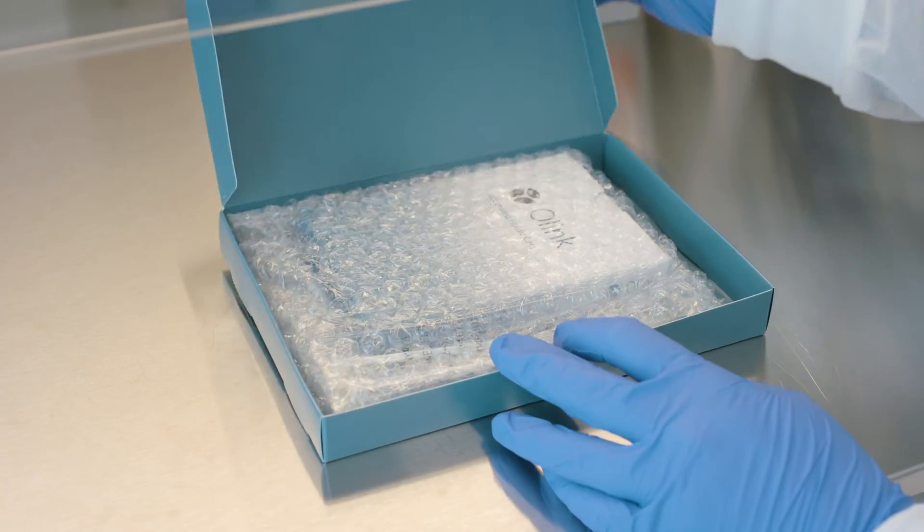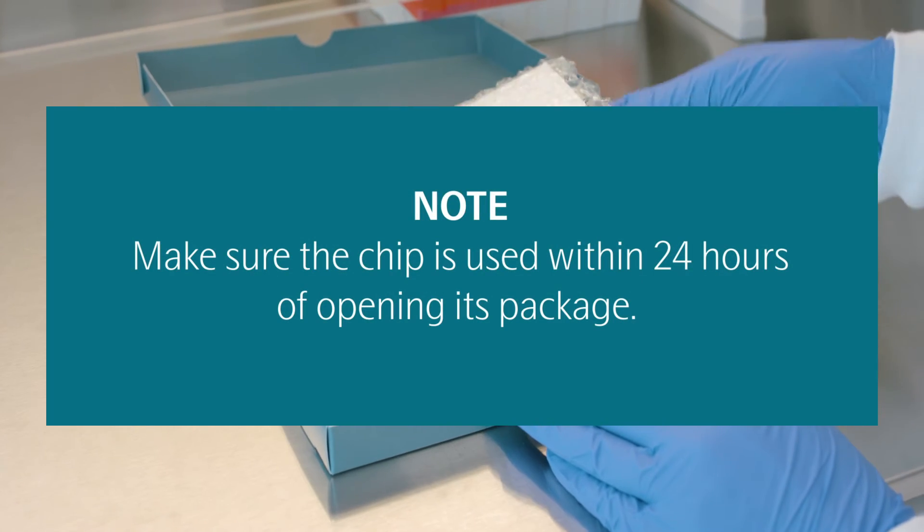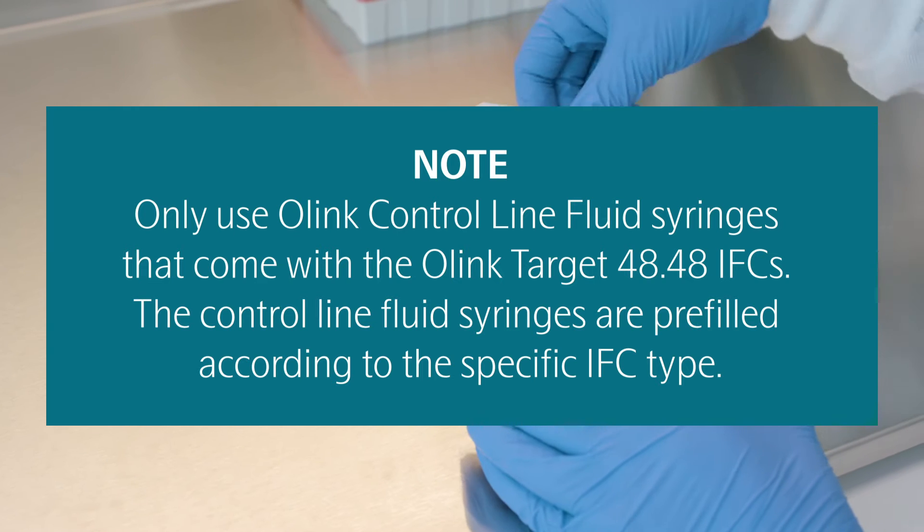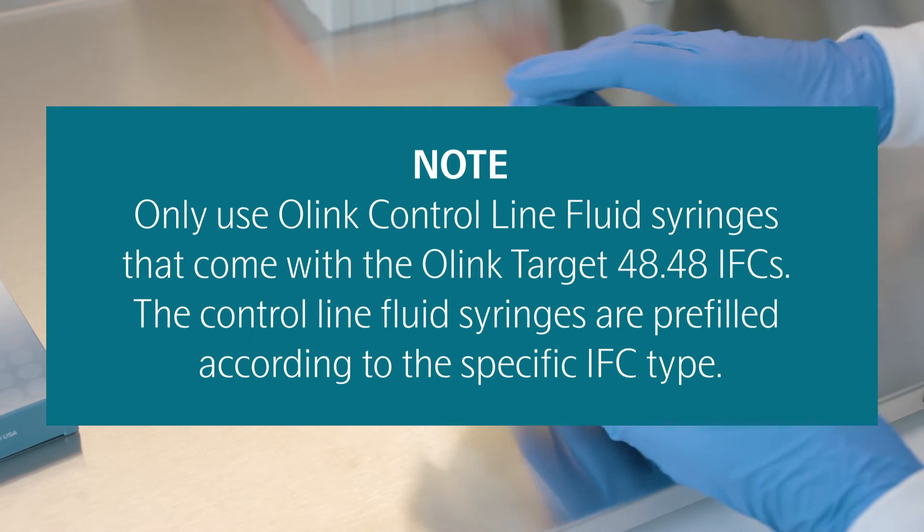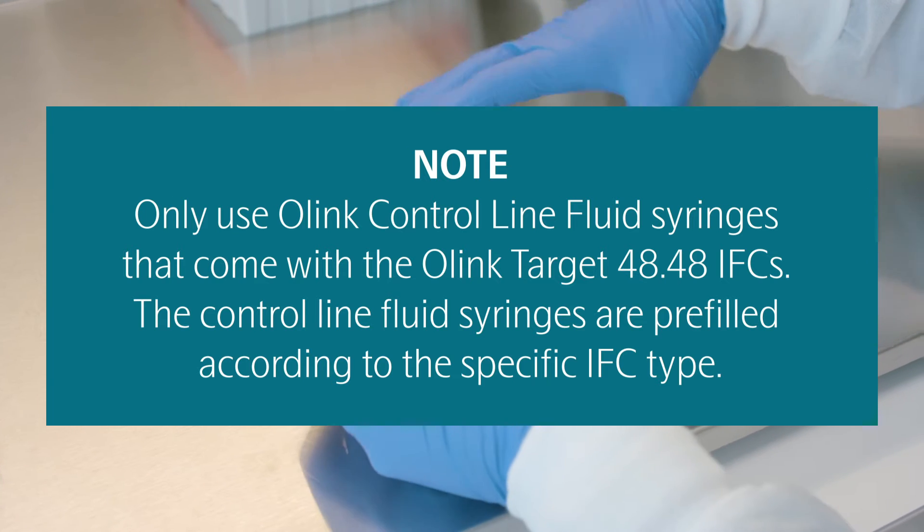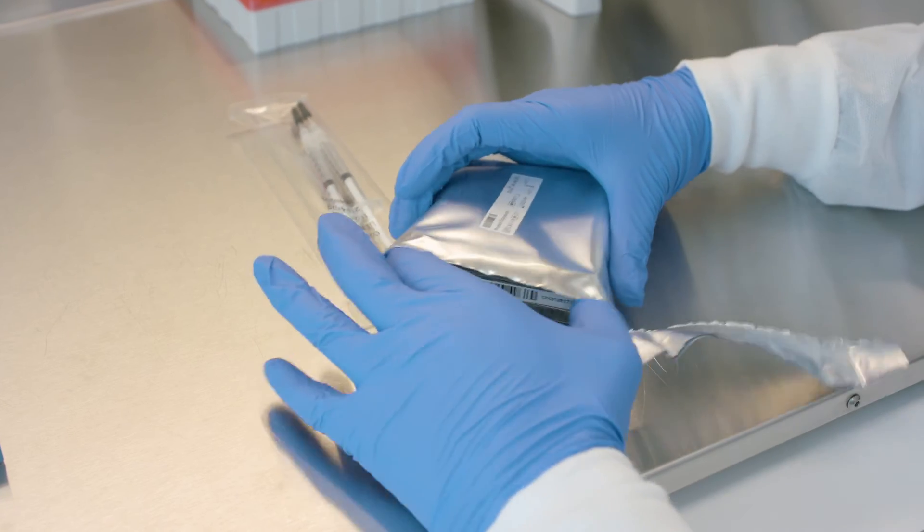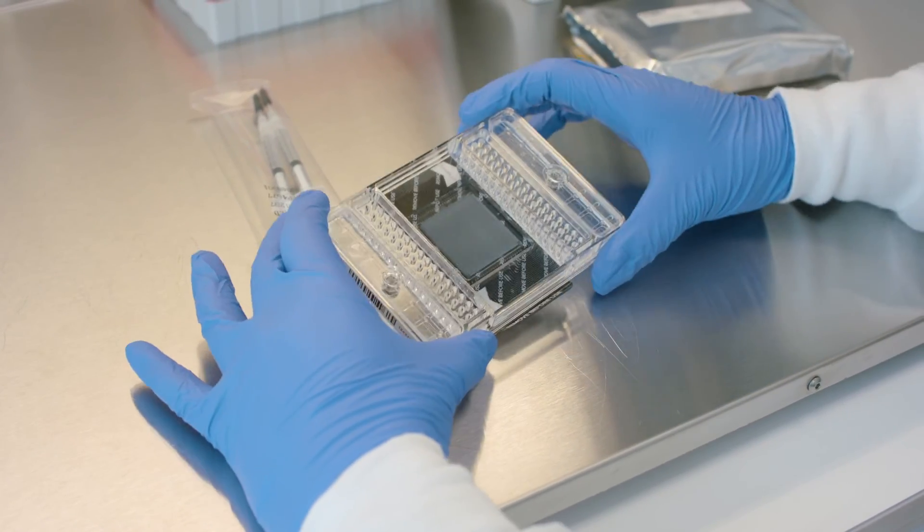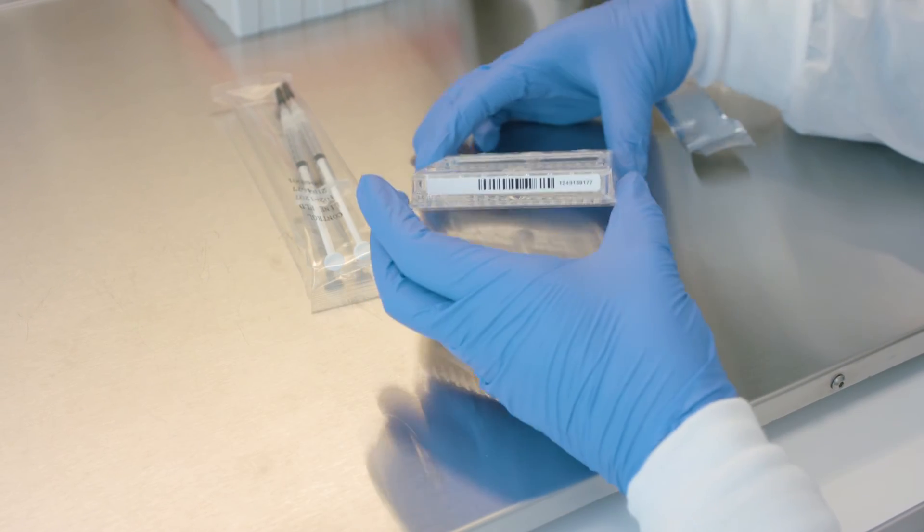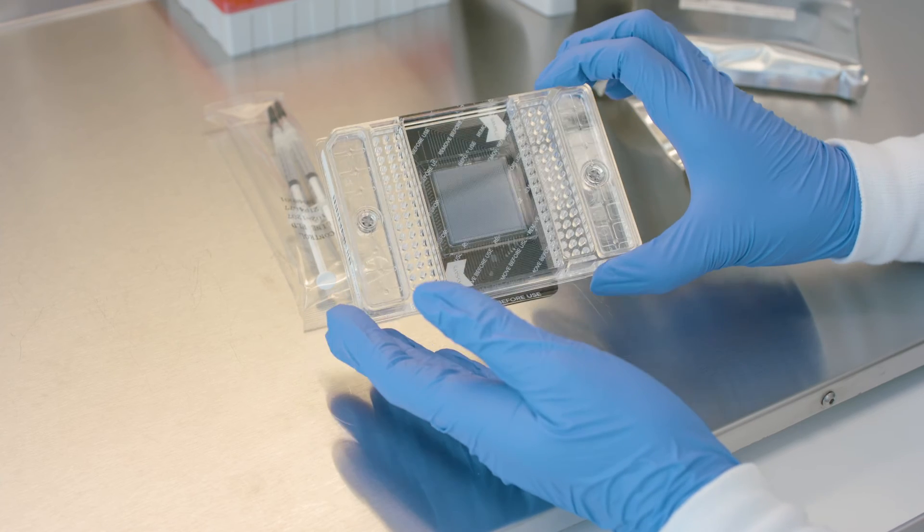Make sure the IFC is used within 24 hours of opening its package. Only use control line fluid syringes that come with the Olink 4848 IFCs. The control line fluid syringes are pre-filled according to the specific IFC type. Begin by unpacking the control line fluid syringes and the IFC from the box and foil envelope. Inspect the chip for any visible damage, and ensure that the barcode label is intact, and that the chip surfaces are clear of particulates before use.